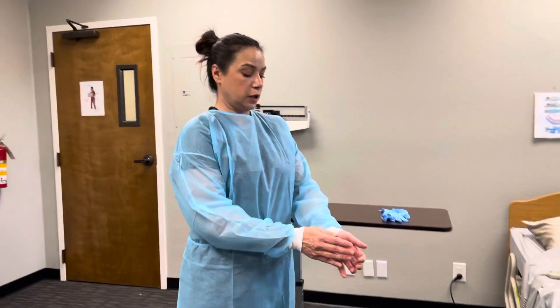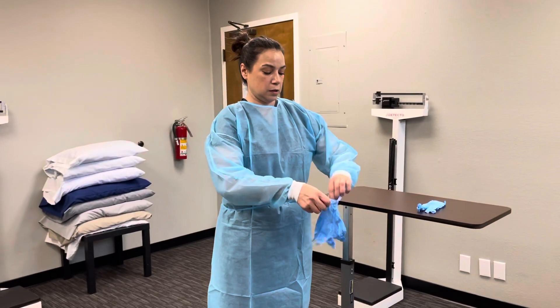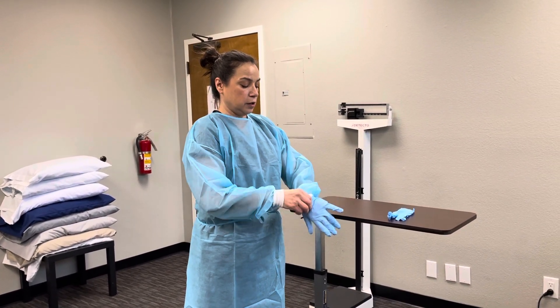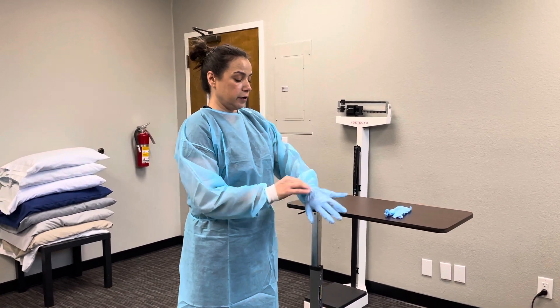Now I'm going to put on my gloves, making sure that the wrists are covered.